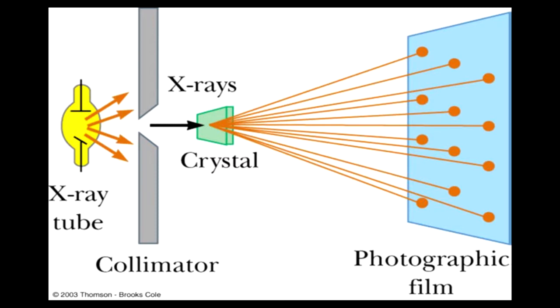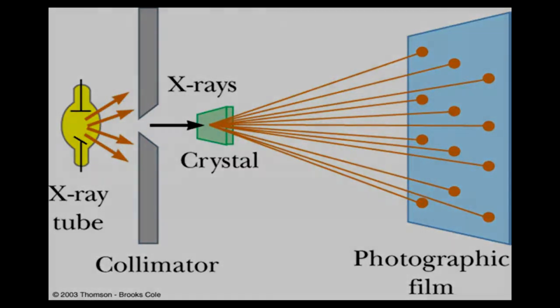After that, we can see the photographic film will show the diffraction pattern for the experiment.